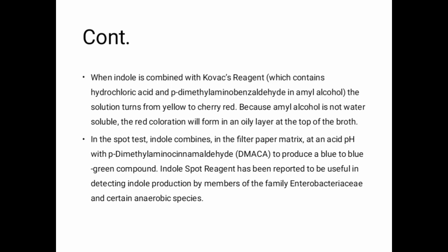So why is amyl alcohol used? Because it is not soluble in water, the color that is produced in the tube will be at the top of the broth. Within the tube there will be an oily layer, and if indole is present, the color is produced in the oily layer at the top of the broth. So we can easily interpret the result and easily identify it.